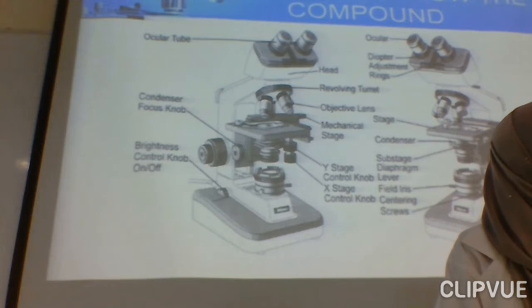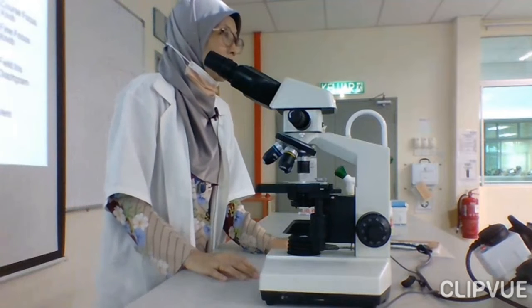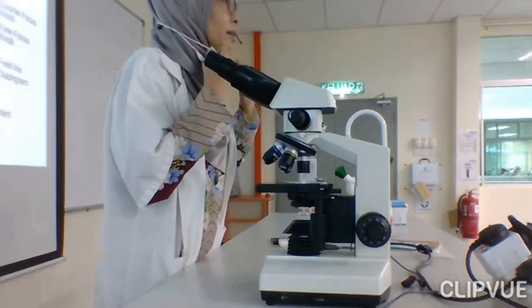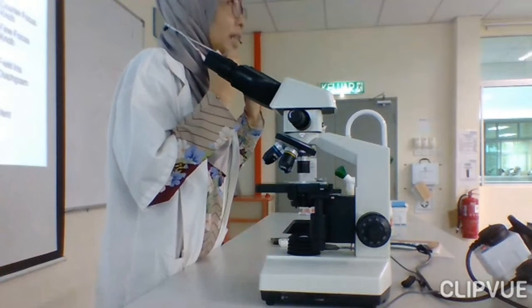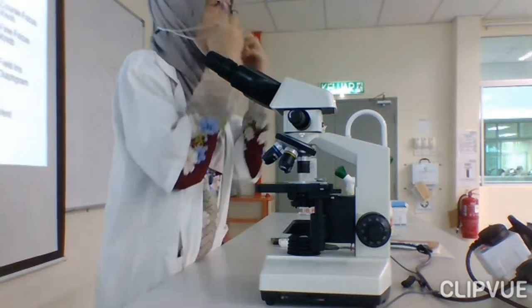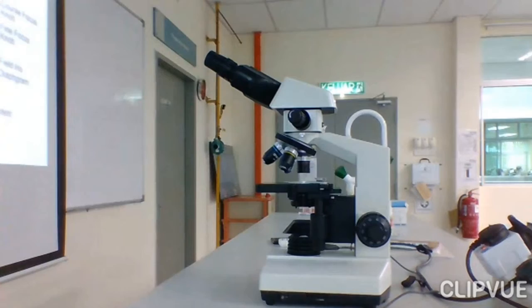So now, taking a look at the eyepiece. Have you put your letter E there? How's the image like for letter E, everyone? Inverted. Yes, it should be inverted. Do you get a clear image? Very good. Hold on, let me see what's wrong with yours.